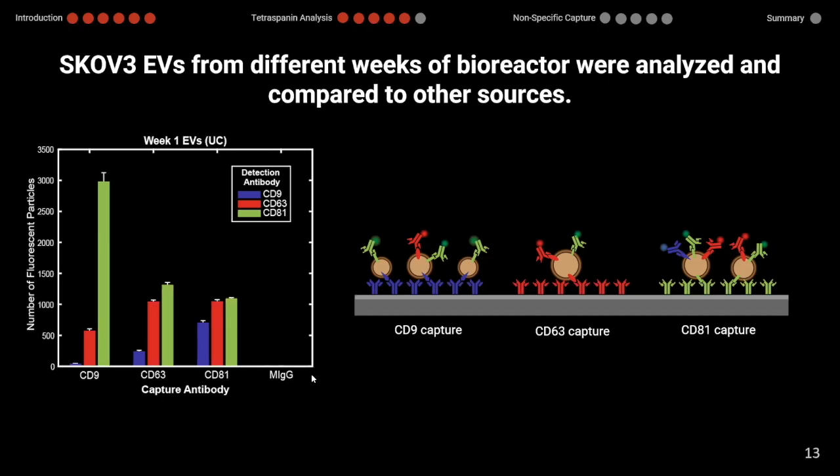A question: for the flow cytometric data, did you use the same fluorescent channel for the 3 different markers? Yes, we used the same exact antibodies that we used with ExoView. I believe it was Alexa Fluor 488, 555, and 647. We used those same exact antibodies with the flow cytometry, and then used the different channels that we had available on the flow cytometer. Those are probably slightly different bandpass filters than what we would see on the ExoView itself. So there is a possibility that we were detecting with different sensitivities of those exact markers between the two techniques, and that also could have caused some of the discrepancy that we saw.